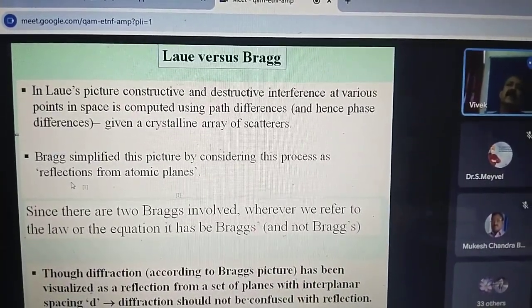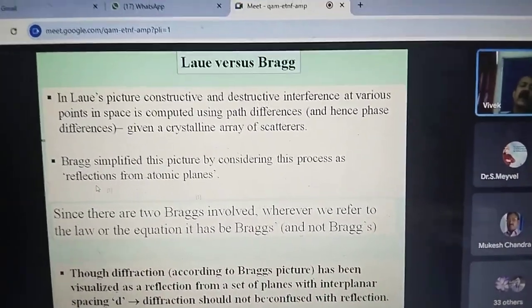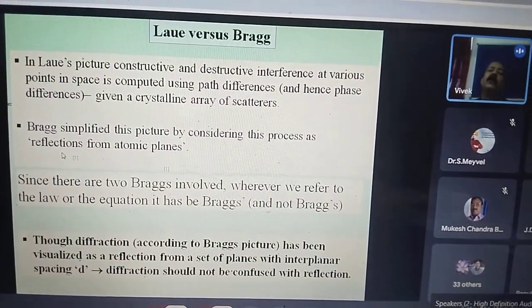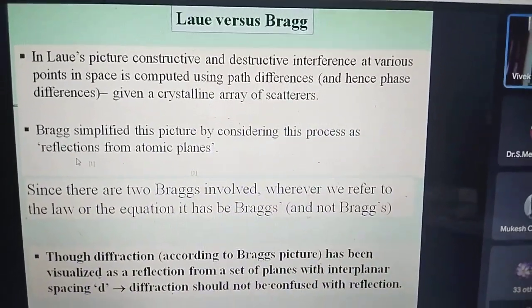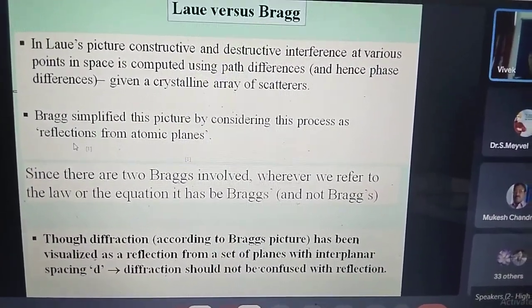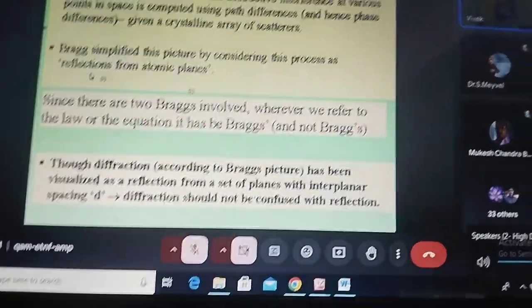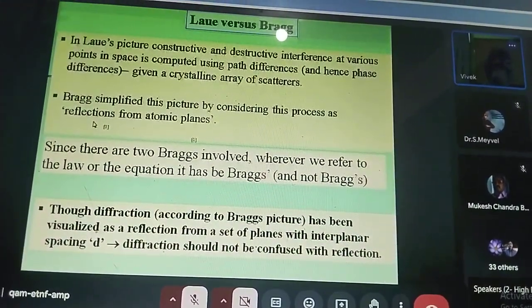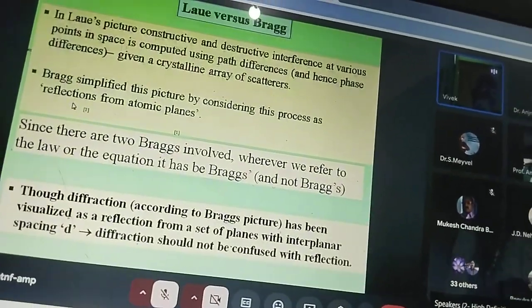So P1 and P1 bar depends upon the data you collect. Whenever you perform any X-ray diffraction experiment, you get, from each plane, how much intensity is coming. Say the 100 plane is giving me 1000 intensity, the 123 plane is giving me 100 intensity, the 300 reflection is giving 0, 400 is giving me 5000 intensity, 600 is giving 5000, and 500 is giving almost 10 or 20.